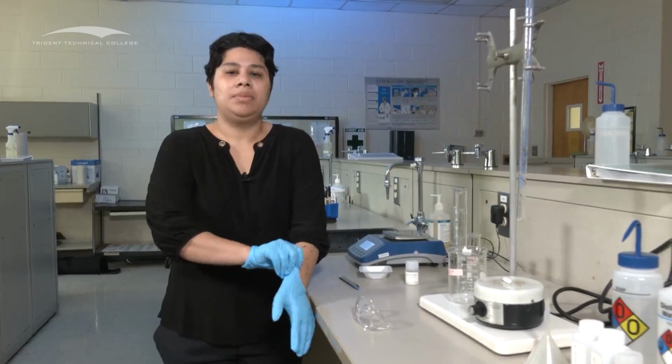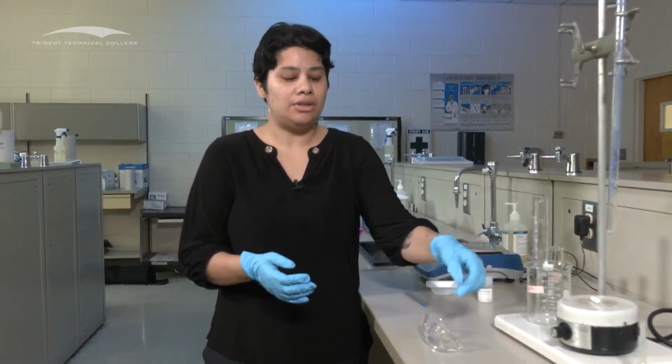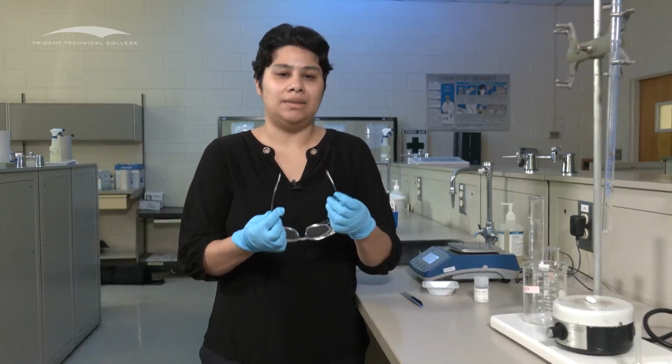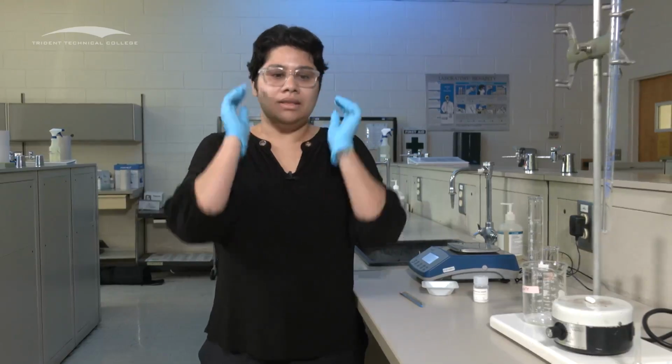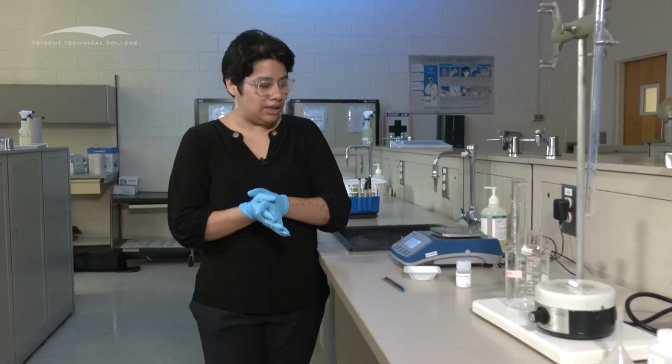Now for this lab, before I begin, a couple of safety reminders. If you get any acid or base on your hands, please take off your gloves immediately and wash your hands for about 10 to 15 minutes. If they're still itchy afterwards, please let your instructor know. So if you get it on, let them know, and if it's still itchy afterwards, please let them know as well. So to begin, we are going to weigh our solid.